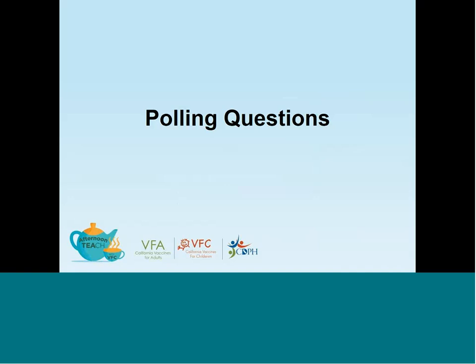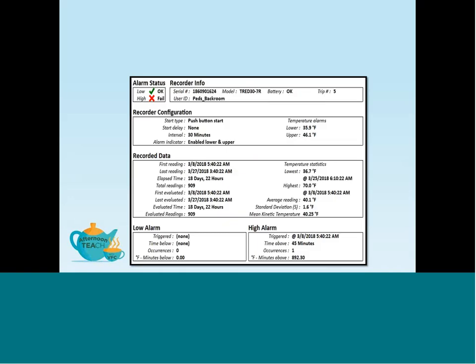Now it's time for our next polling question. Take a look at this summary report to answer the following polling questions. Is the data logger configured according to VFC requirements? Take a minute to answer.